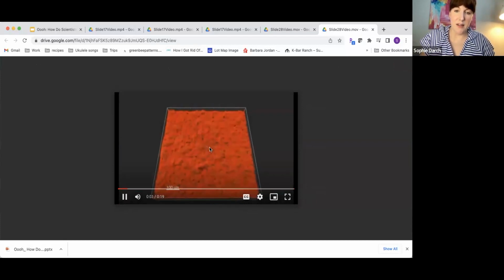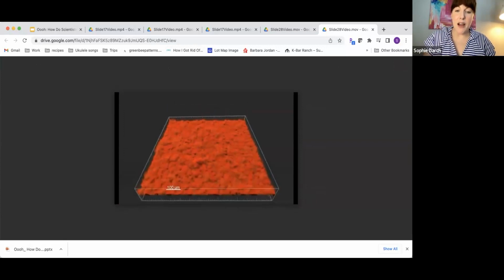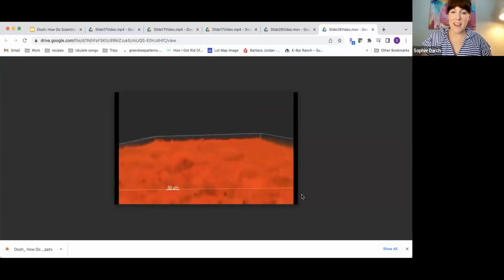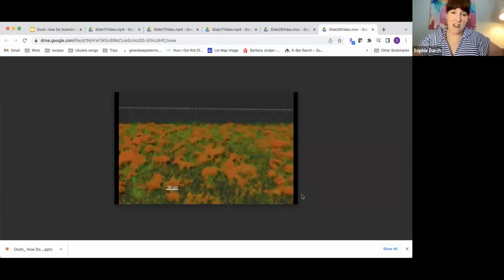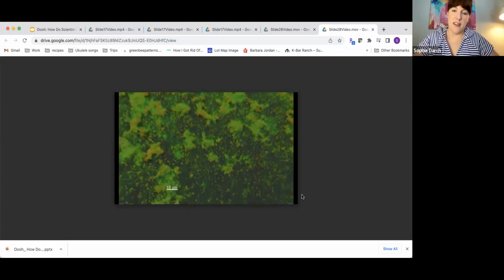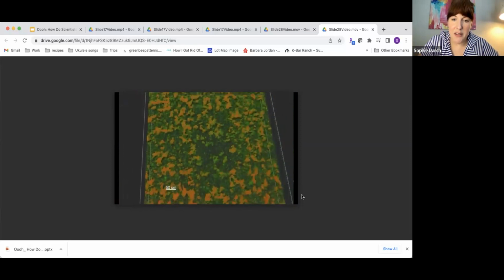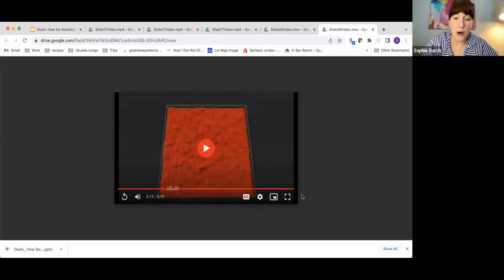I'll just play it again so you can have a good idea. But you can see the biofilm almost looks a little bit fluffy too. So we can see all the extra things that bacteria have around them as a protection layer, so a matrix or such around them that protects them in the environment. But this is a really nice way to distinguish who's talking and who's not.